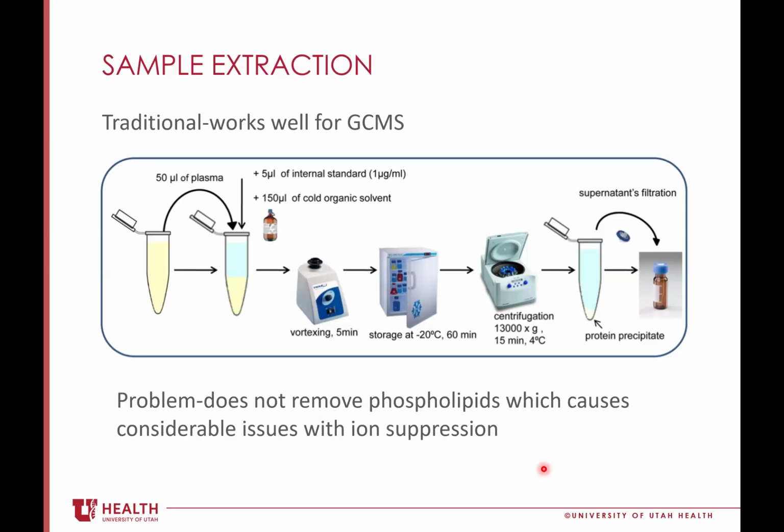But the problem with this approach for LCMS is it doesn't remove phospholipids, and this can cause considerable issues with ion suppression at the mass spec.